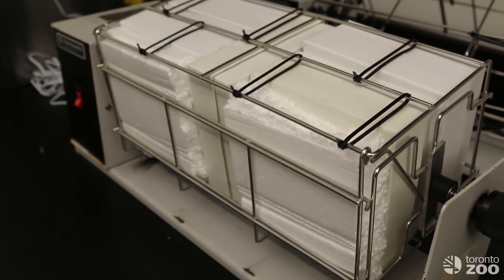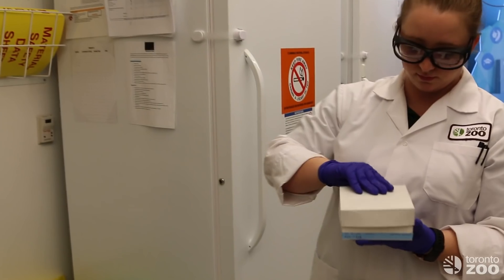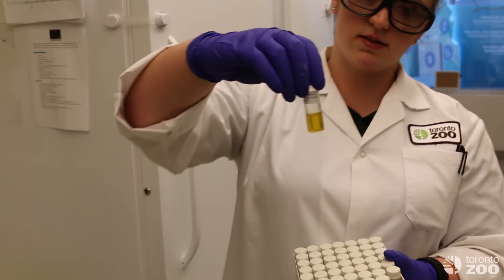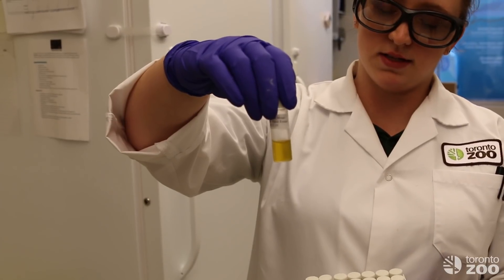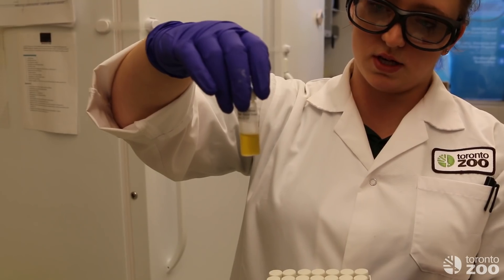In the morning, once those are done spinning, we will then have the extracts that we will pour off, which will look like this. This can then be sent upstairs to our other lab where we will do the hormone analysis.